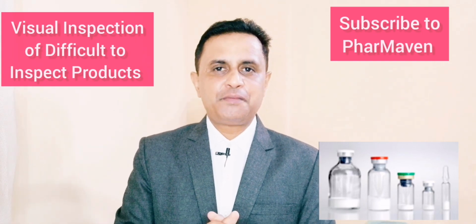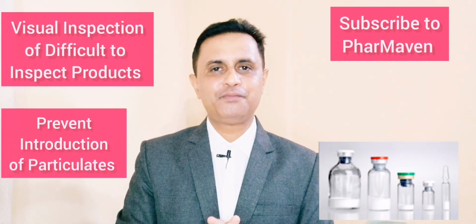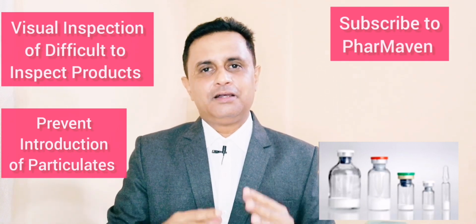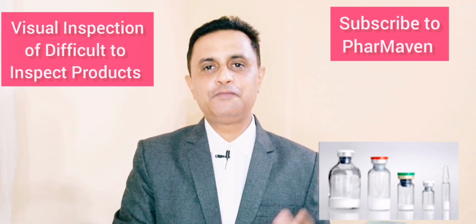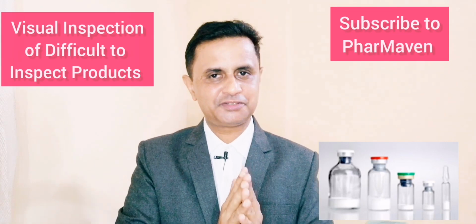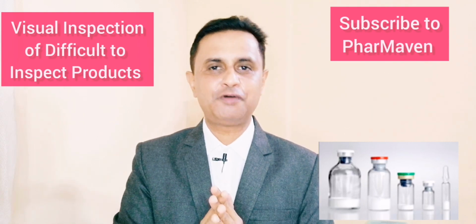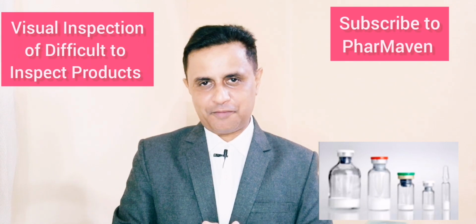All attempts should be made, for lyophilized products and any product, to prevent microparticles from entering into the product. The inspection process detects deformity during the process. It will not correct the deformities in the production process. It will only indicate that in your system there are certain problems which are causing these particles. The same fundamentals go with the lyophilized product.